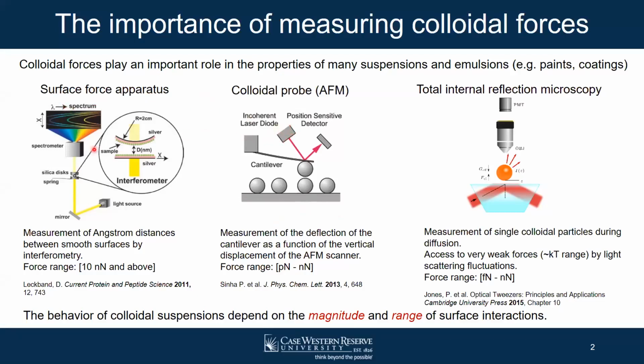These techniques essentially use mechanical manipulation to bring surfaces in close proximity and then measure deflections in order to infer forces. The thing that really limits you with these techniques, although they've obviously been adopted broadly by both academia and industry, is that you're limited by your ability to mechanically manipulate your arm. So for example, in AFM, the level of sensitivity with which you can measure really depends upon the ability to manufacture a cantilever that can measure such sensitive forces.